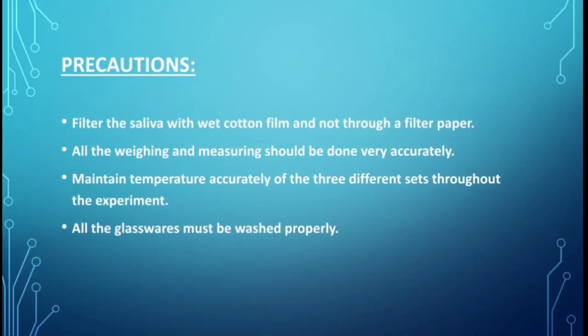Now the precautions. Filter the saliva with wet cotton and not through filter paper. All the weighing and the measuring should be done very accurately. Maintain the temperature of the 3 different sets accurately throughout the experiment. All the glasswares must be washed properly. So these are the precautions.